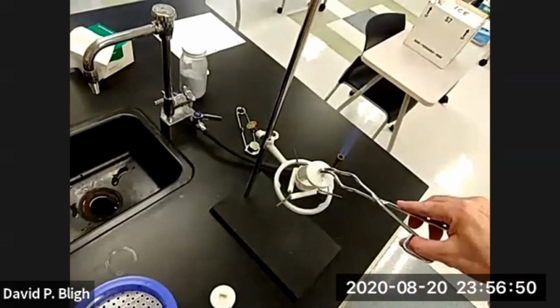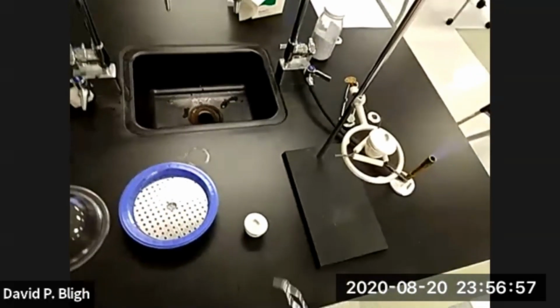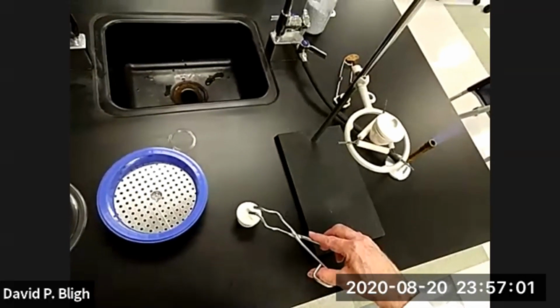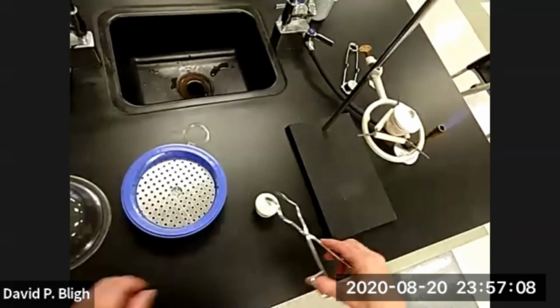These crucibles have a name, by the way. They're called Gooch crucibles. Gooch. Probably named after somebody. So now let's move this one. I'll tell you what, let's take the lid off.